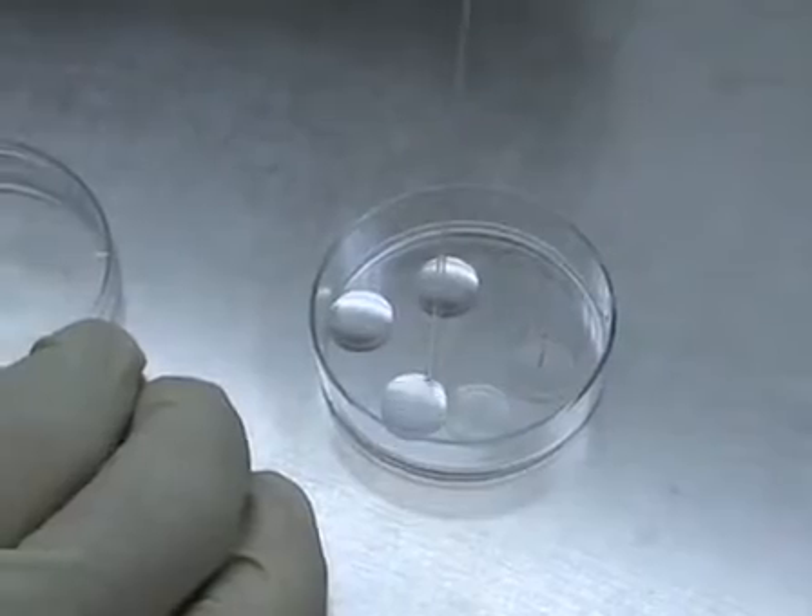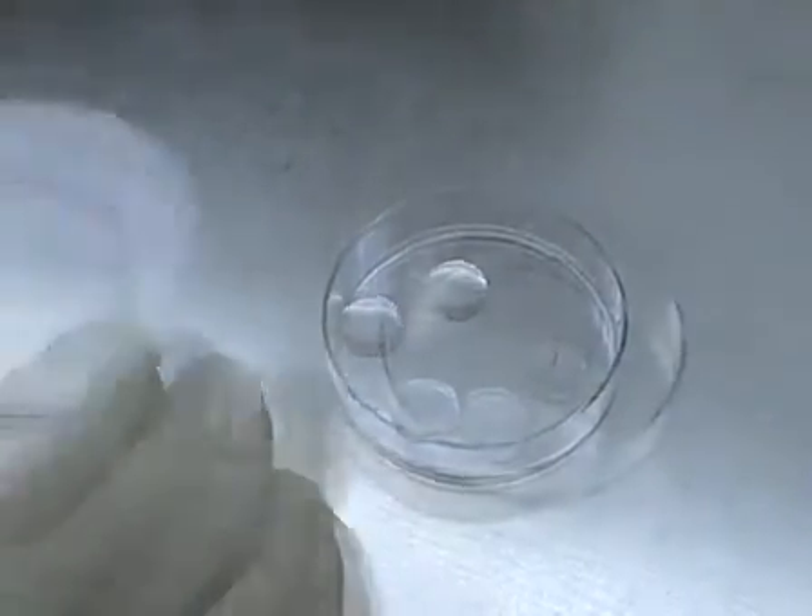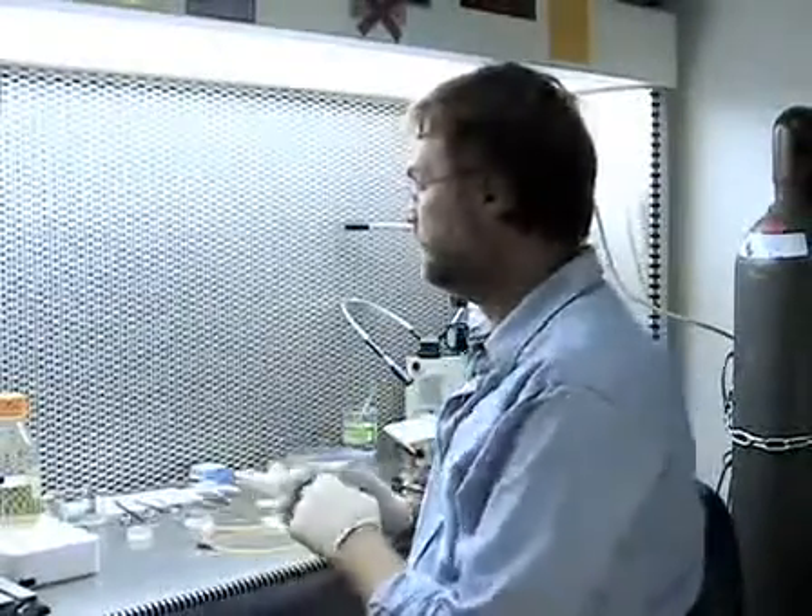Depending on the application, you use big dishes or small dishes, or you can use glass cover slips. This is the typical setup for the hood, and I'll briefly explain to you what solutions you need to have ready and also which instruments come in handy for the isolation and dissection of the brain and then the actual sectioning of the brain.